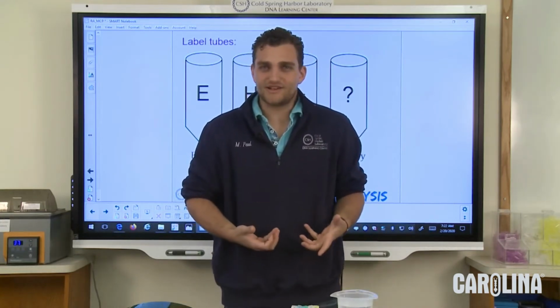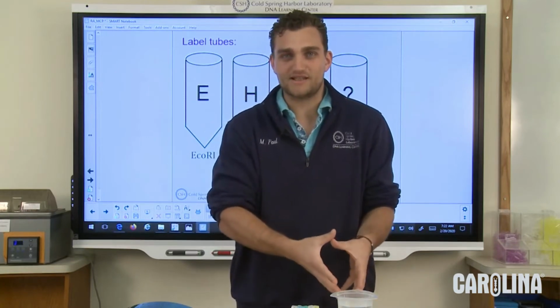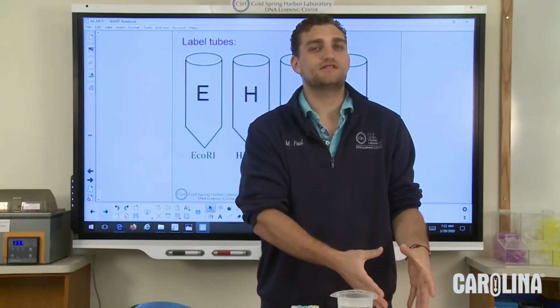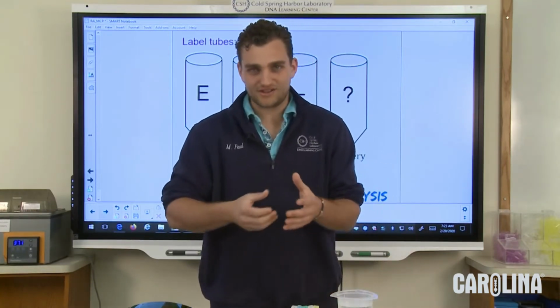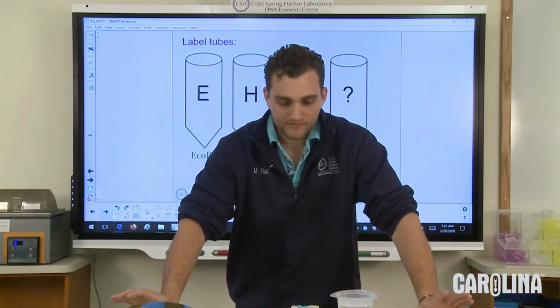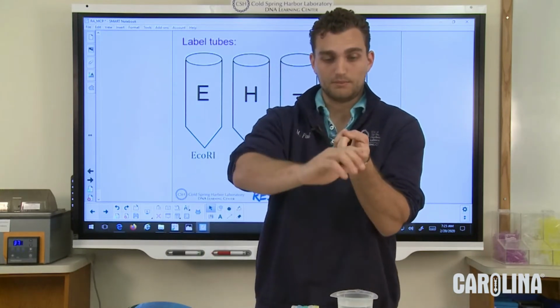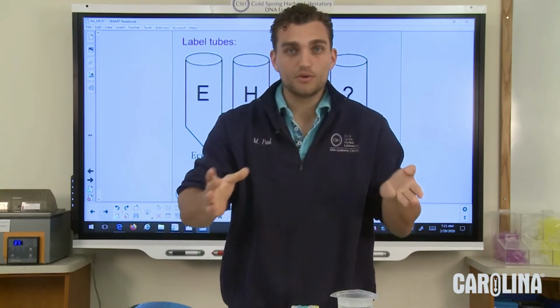We have a lot of bacteria inside of us, right? It's always a fun thing that I like to say, we're mostly bacteria. We have more bacterial cells in our body than human cells, which is just an interesting little fun fact I always like to bring up. Now, basically what we said is we need DNA, we need buffer, and we need enzyme. And that's all we really need.